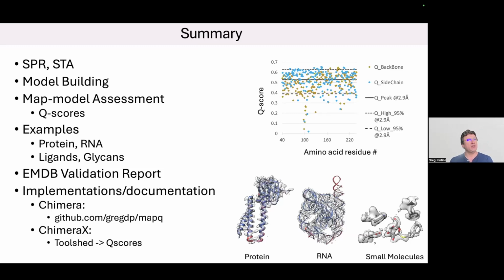There are a lot of questions as to whether these maps capture these atomic details, or whether the averaging process might disturb the actual quality of the map. So this might be a good indication as to whether these methods are actually working well, or maybe need some adjustment in how they composite the two maps together.